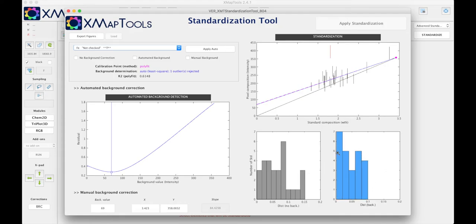We see that with the background the distribution is much better than with only the old method, the curve going through zero.